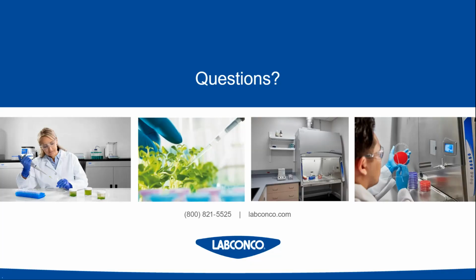Our first question is asking, how often do HEPA filters need to be changed? That's a great question. So it really depends on the type of work that's done inside the biosafety cabinet and where the biosafety cabinet is located.